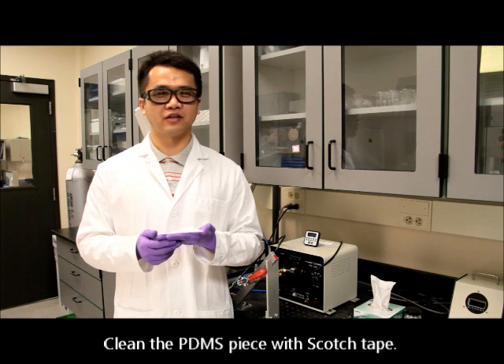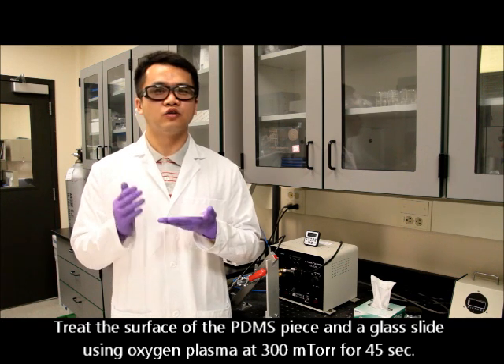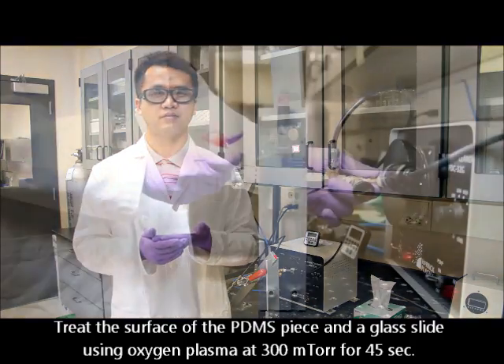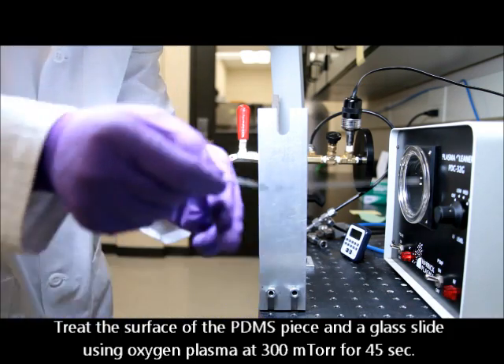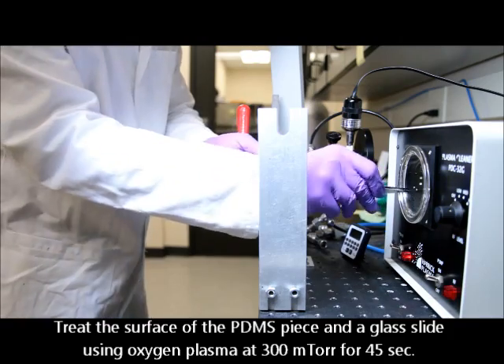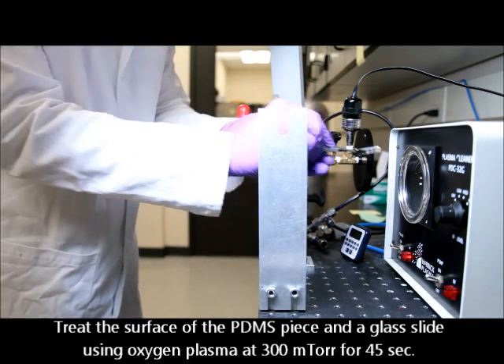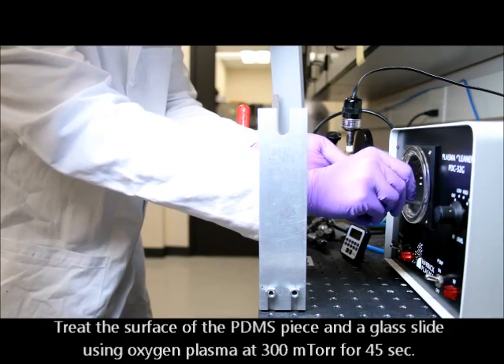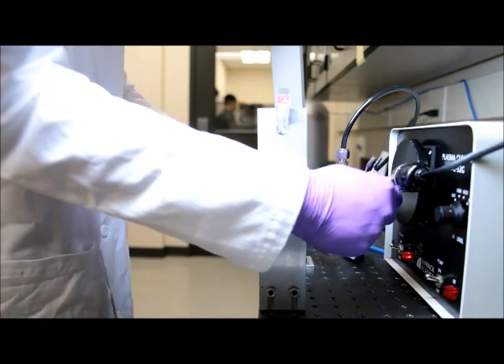Now we have this coated PDMS piece. We removed any debris on its surface using scotch tape. The next step is to treat its surface and a glass slide hydrophilic using oxygen plasma. Then we bond the two surfaces together to form a sealed microfluidic device.